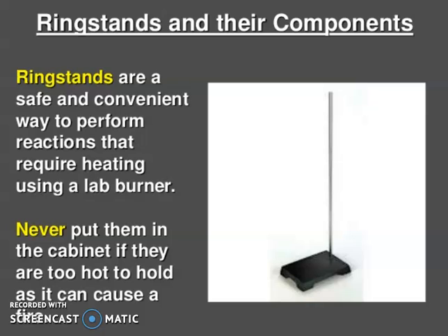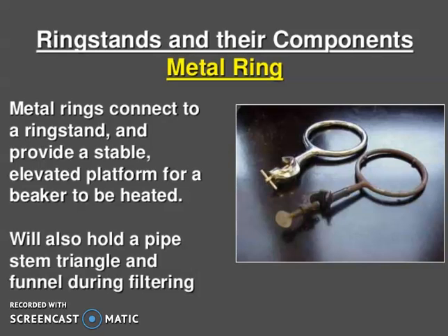Never put them in the cabinet if they are too hot to hold, as it can cause a fire. Now, ring stand and their components: metal ring. Metal rings connect to a ring stand and provide a stable elevated platform for a beaker to be heated. It will also hold a pipe stem triangle and funnel during filtering.